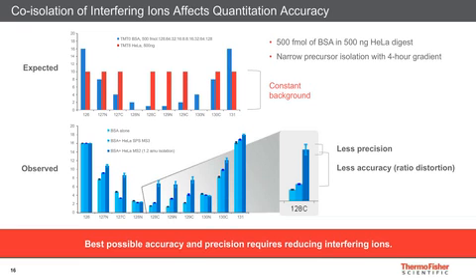The real change in protein expression, which is shown in blue, therefore becomes masked under reporter ion signals from those of the contaminated peptides denoted in red. Ultimately, this can lead to a bias in the relative quantitation ratios, resulting in lower fold changes that are less accurate if the interference is more abundant. But interference can be reduced and even eliminated with the proper sample preparation, LC gradients, and instrument methods.